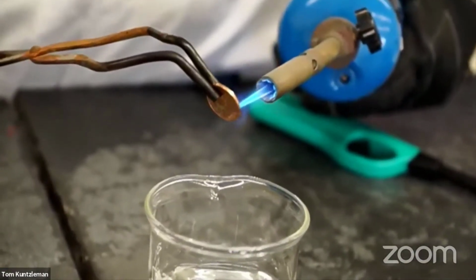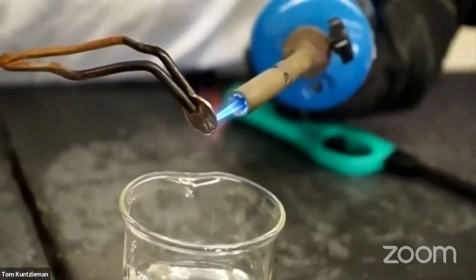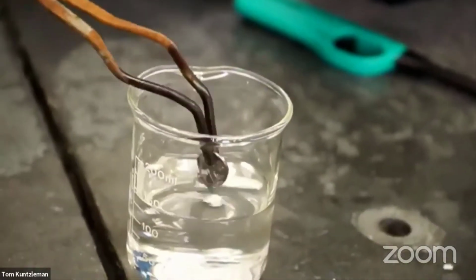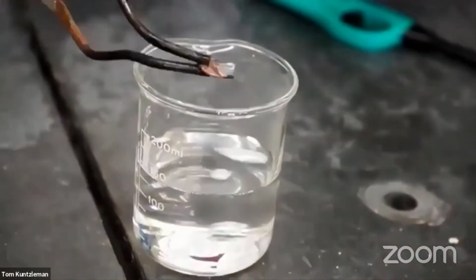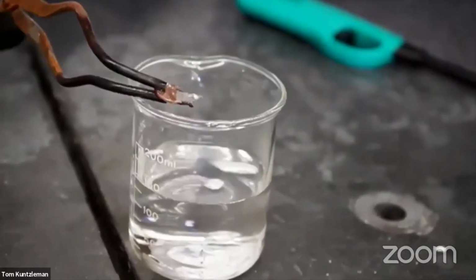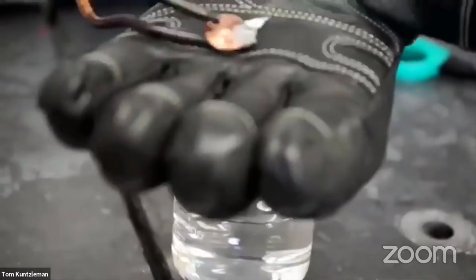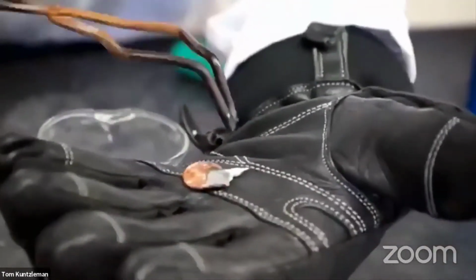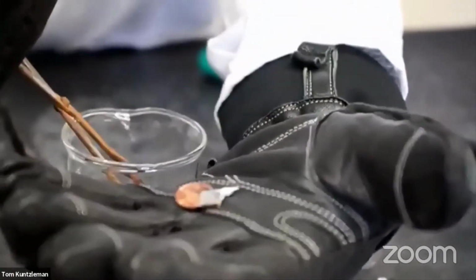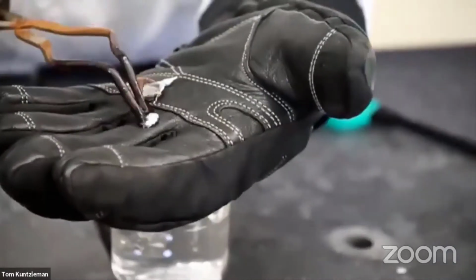What do you see? What's going on there? Oh, I see something happening. Look at that. It melted. That thing melted. And something came out, and the thing that came out doesn't look like copper. It's just been wet, so it's cool. So I'm going to go ahead and place it in my hand here. Yeah, that doesn't look like copper over here, does it? You can sort of see where the drip was. Let's see if I can pull this one out. What is this? Huh. That looks silvery to me.